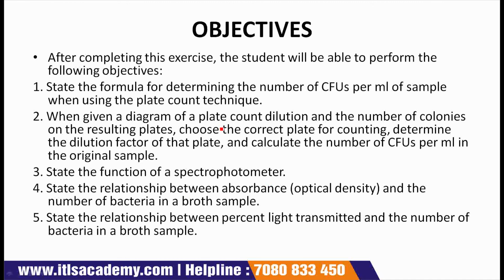So now we will see what are the objectives of this test, why we do enumeration of microorganisms. After completing this exercise, the student will be able to perform the following objectives. Very first objective is, state the formula for determining the number of CFUs per ml of sample when using the plate count technique.